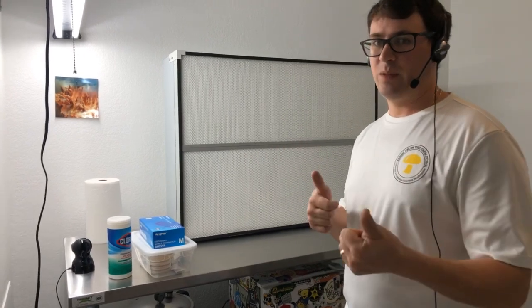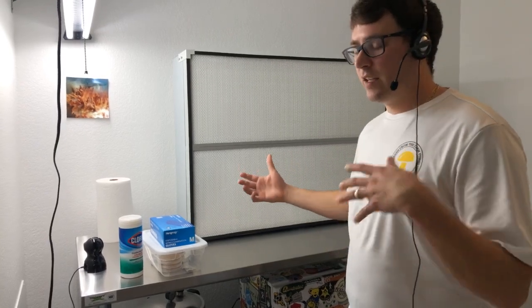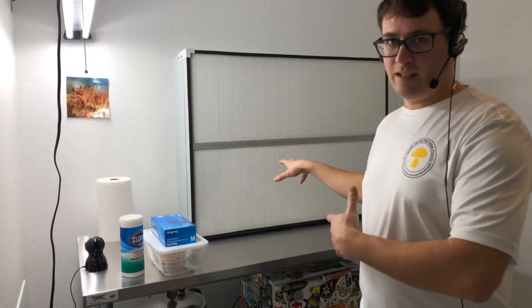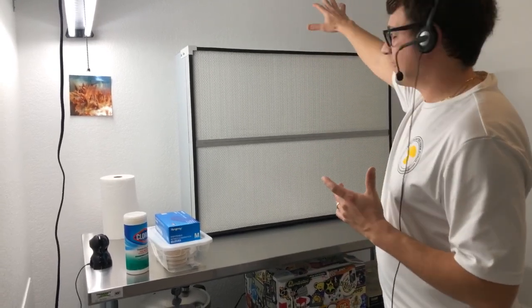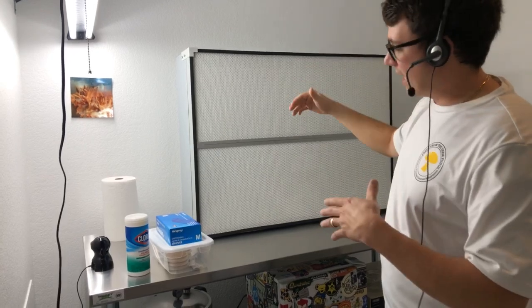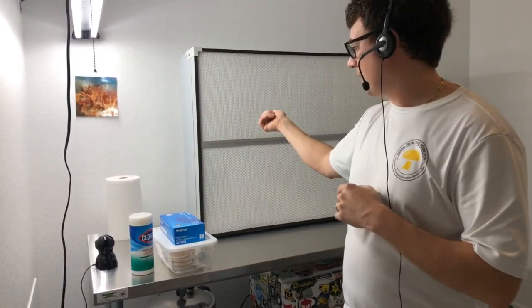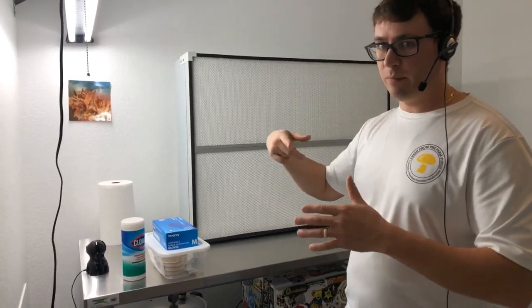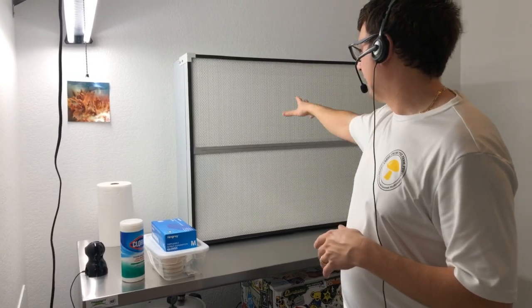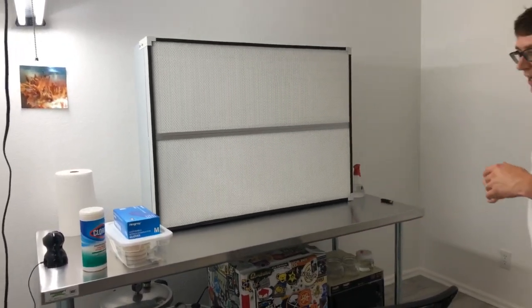Last week I did the unboxing of our flow hood from Myers Mushrooms, and we had a lot of questions and concerns about the legitimacy of this flow hood. A lot of times you'll see the fans above the HEPA filter, but there's actually about a six inch case behind the filter with a blower motor that's forcing the air through, which is creating the laminar flow.